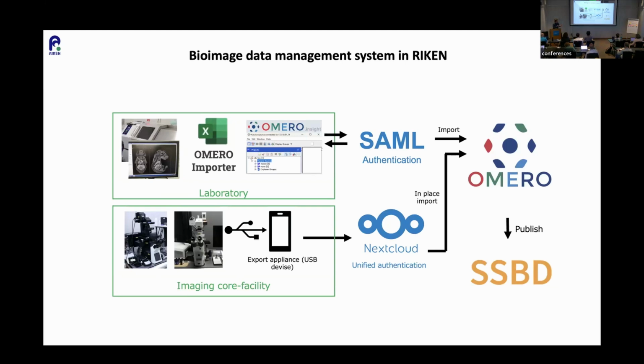So we are now trying to install an e-notebook kind of system into the laboratory and the facility, so they need to write down once in the notebook. Then we will automatically get the metadata from the e-notebook or other system. That is what we are now developing, and so we have come here to present a poster and discuss with you, since we are still in the process of developing.